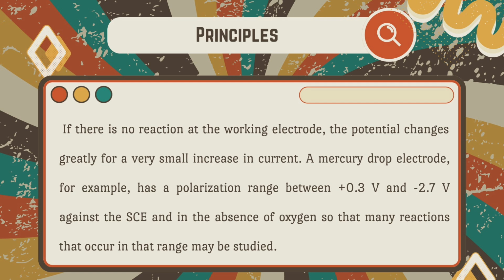This may be calculated by considering the reaction at each electrode and adding the extra potentials or overpotentials due to polarization effect at the electrode and to the voltage needed to drive the current against the resistance of the solution. In this example, in order to drive the cell reaction, a voltage greater than about -2.54 V must be applied.